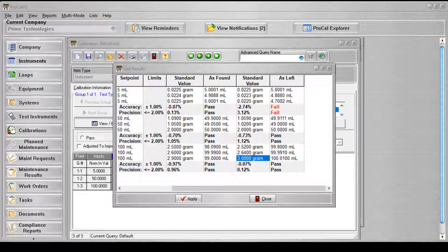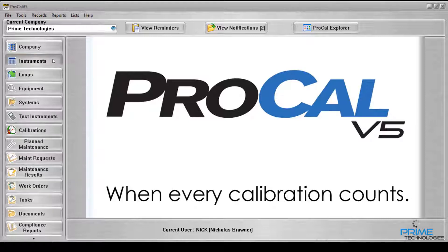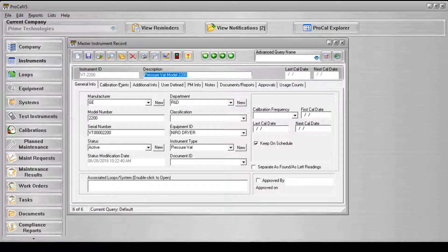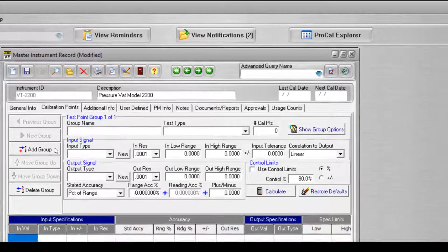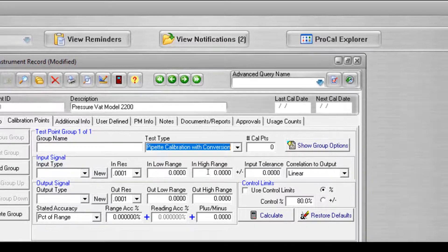Next, we'll look at the pipette test type package with conversion. The pipette with conversion test type package is designed to perform a conversion between mass and volume. When creating a new master record that uses the pipette test type package with conversion, the test type must once again be applied to the record through the calibration points tab on the master record screen. Once a new group has been added to the record, click the test type drop-down list and select Pipette Calibration with Conversion from the available test types.